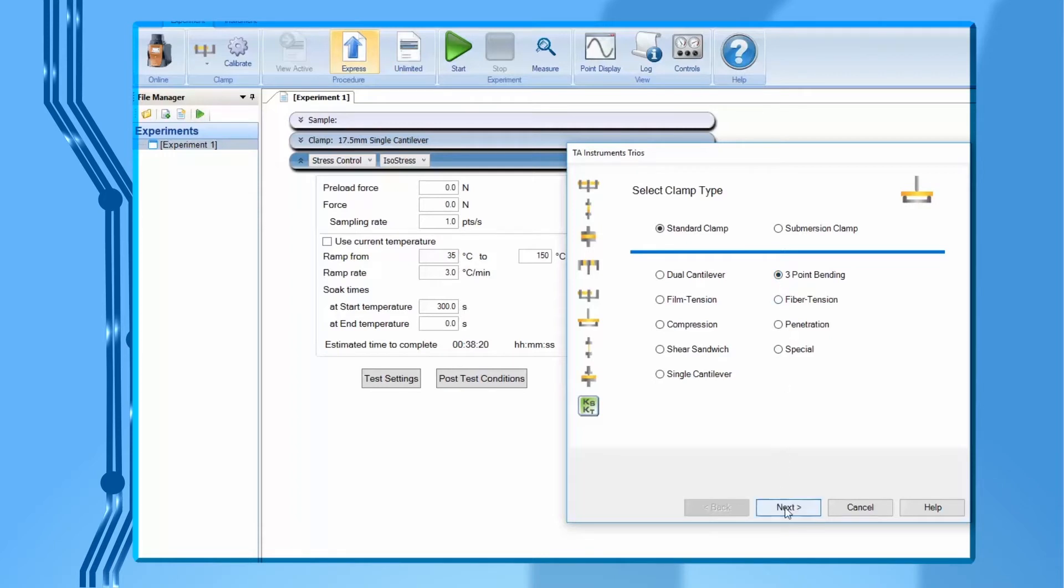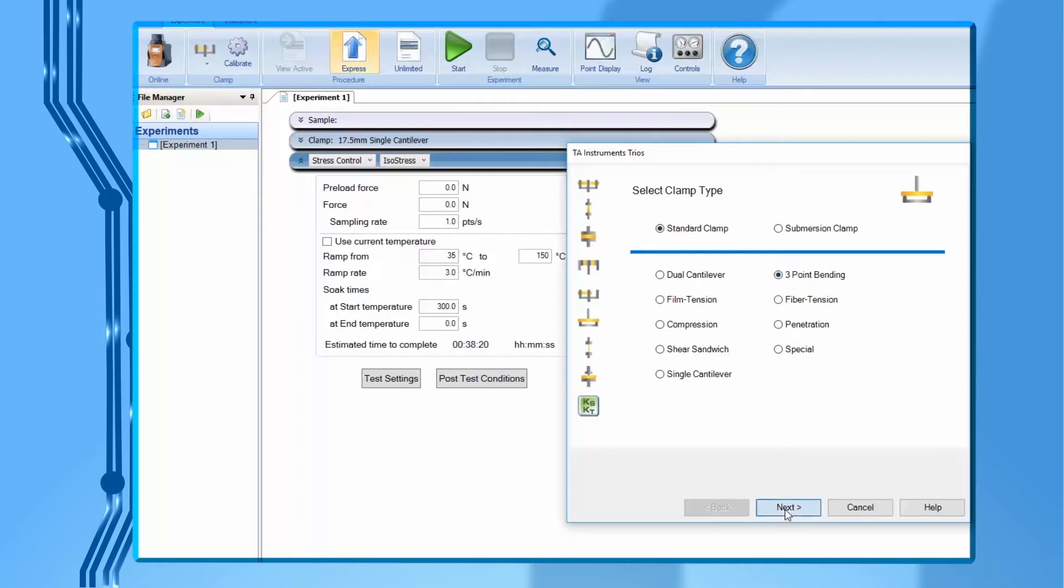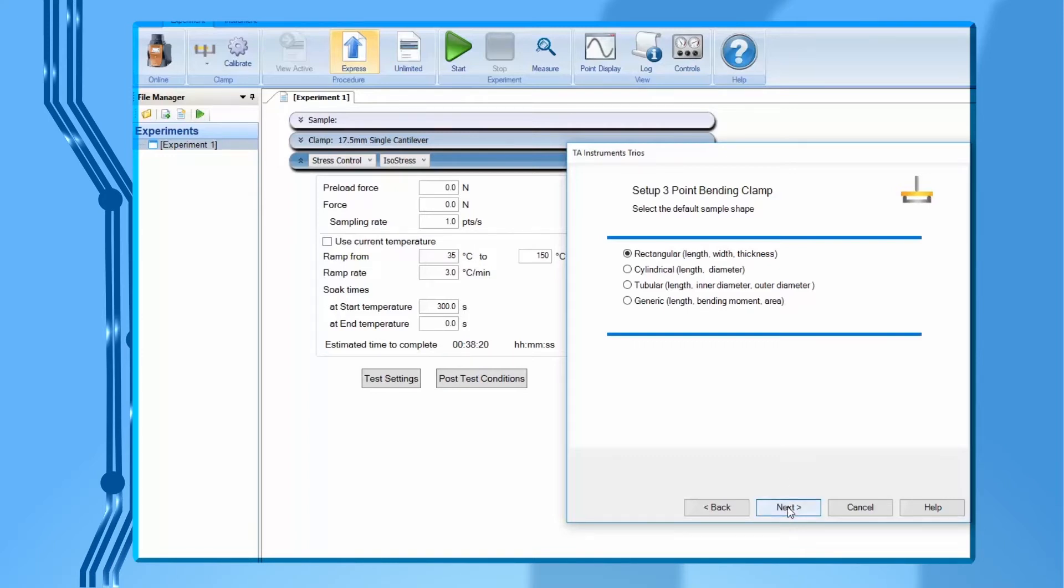In this page, select your sample geometry, for example rectangular, then click on next again. In this video, we'll be using the 50 millimeter three-point bending clamp as an example.